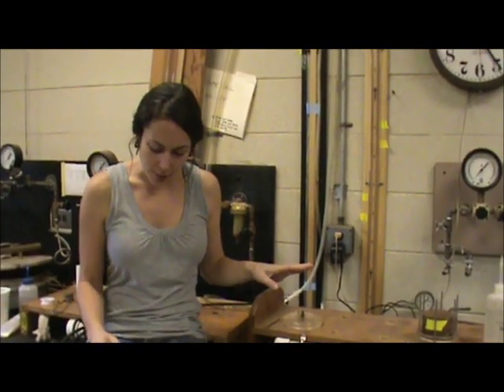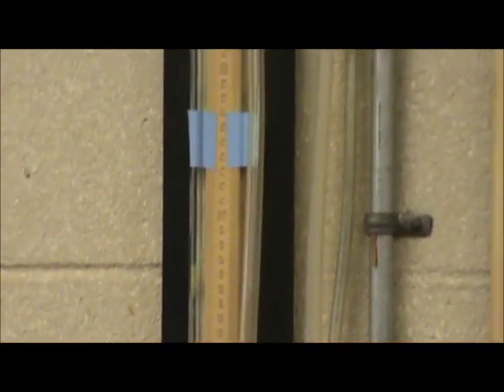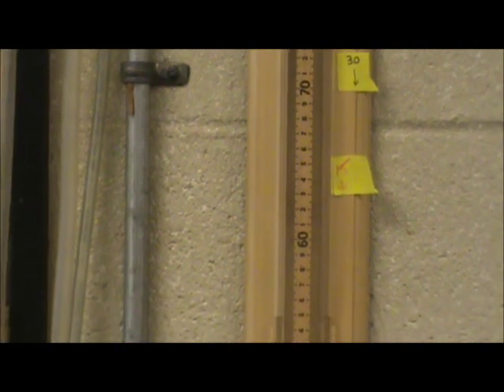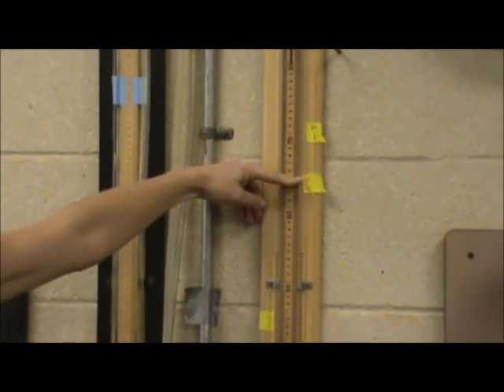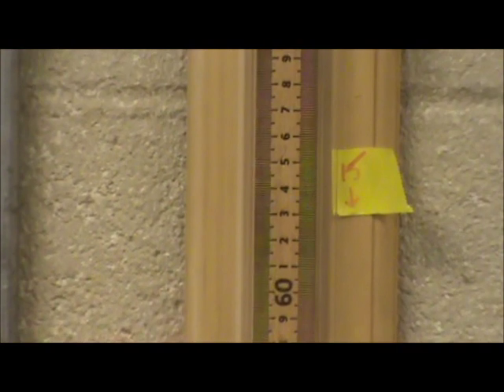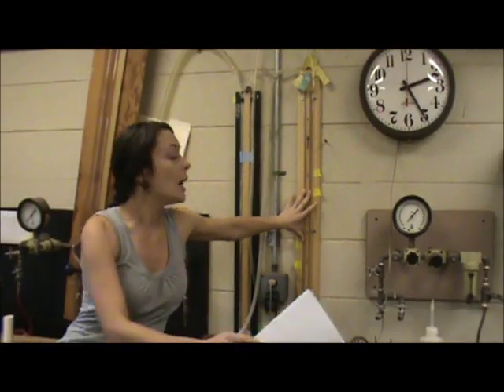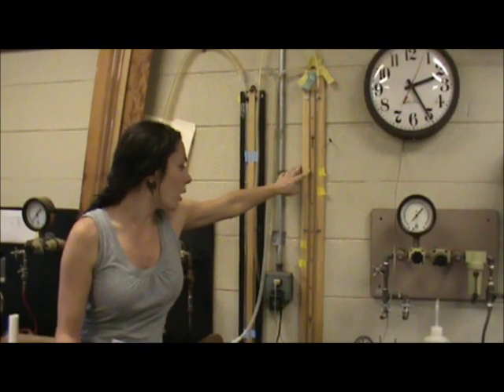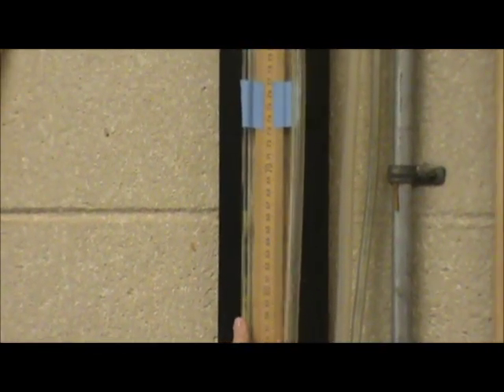Now I'll explain the pressure manifold. Right here we have water, and over here we have mercury. We're going to use the water to measure the lower pressures — at 0.015 bar and at 0.029 bars — which corresponds to 15 centimeters of water and 30 centimeters of water. We'll put the setting on 15 centimeters and continually take weights until we have one stable weight, then change to 30 centimeters and do the same thing. From there, we'll move over to the mercury, which will be used for the 0.09 bar and the 0.18 bar pressure settings.